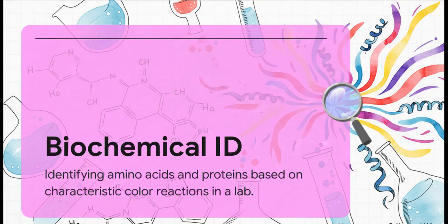Grounding ourselves in the science here, biochemical identification is defined as the laboratory process of identifying specific amino acids and proteins based on characteristic color reactions. Color is absolutely our primary weapon. By utilizing specialized reagents, we can force specific chemical groups within the amino acids to react, creating these unique, vivid colors. It's kind of like applying Invisible Ink Developer to a blank page. Suddenly, boom, the secret message appears in bright red, purple, or yellow.